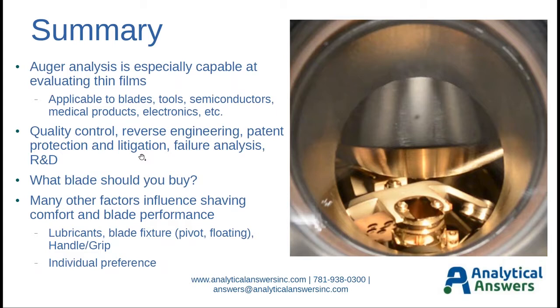You can use it in patent protection and litigation. If you have a failure during production or from the field, you might be able to use it to diagnose what may have caused that failure, some interfacial contamination, or you can use it for R&D.